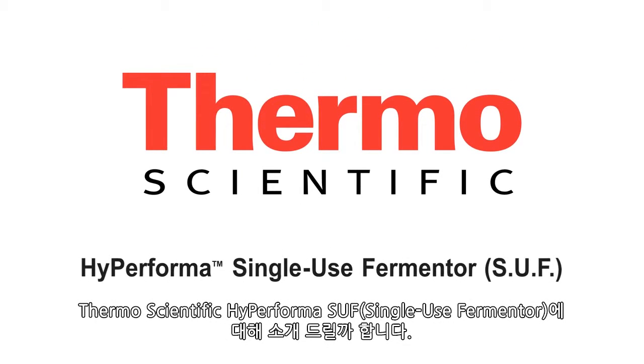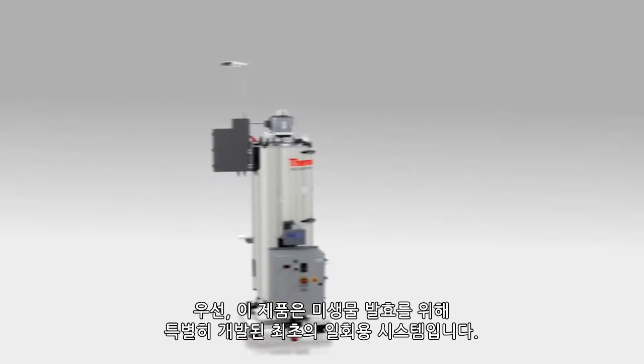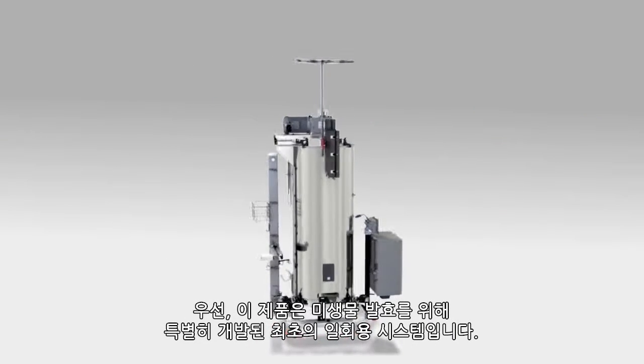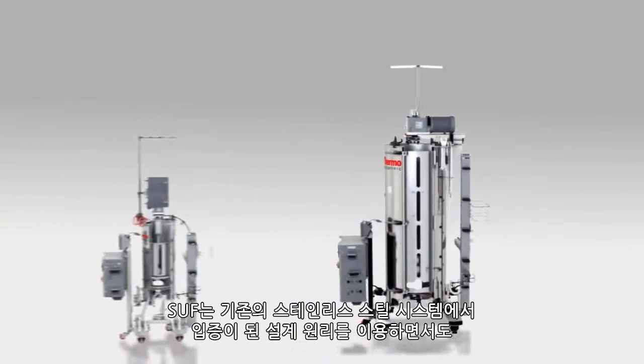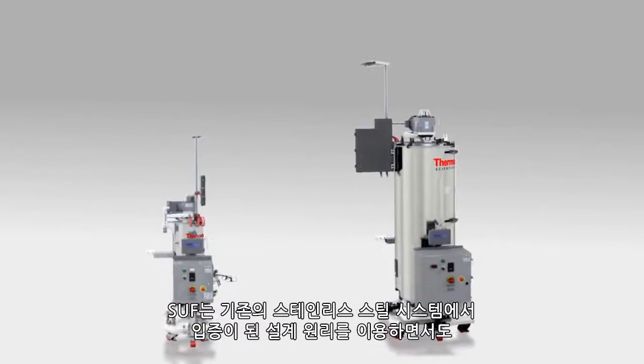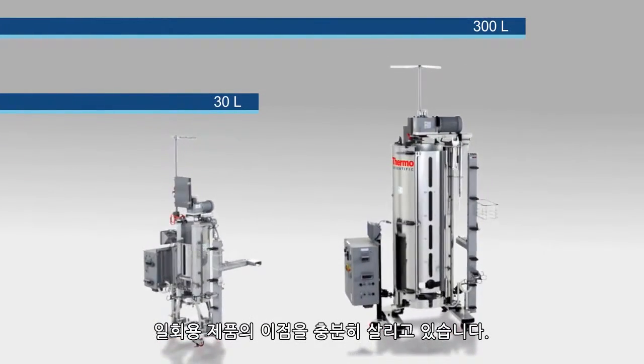Introducing the Thermoscientific Hyperforma Single-Use Fermenter, or SUF, the first single-use system specifically engineered for microbial fermentation. The SUF leverages the same proven design principles of conventional stainless steel systems, while taking advantage of established single-use benefits.